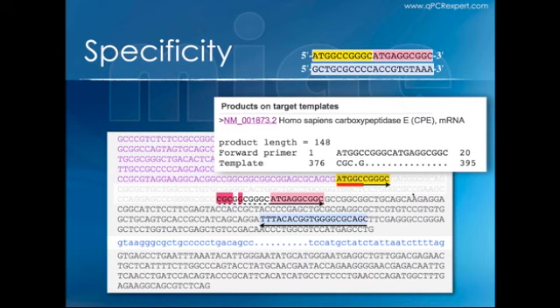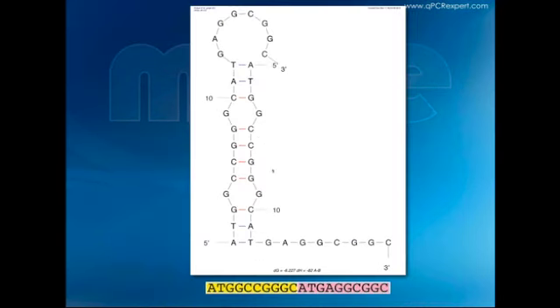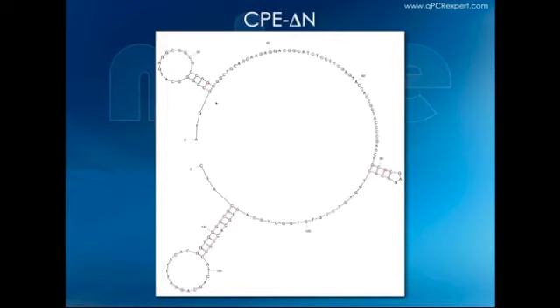The second problem with this assay is that the forward primer is highly structured—it binds to itself and forms a stem structure. At the annealing temperature, this internal stem structure has to compete with the amplicon for binding, suggesting this primer will generate quite an inefficient assay. Furthermore, looking at the amplicon, both the forward and reverse primer binding regions have stem-loop structures, creating additional problems with hybridization and initiating a PCR reaction, especially since the forward primer is already binding to itself.